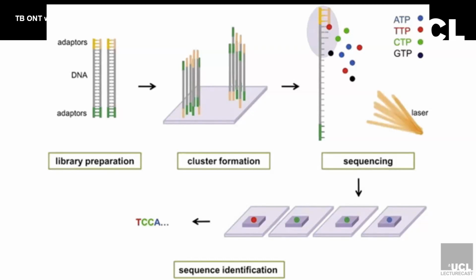So then after you get those sequence readings, you will then use bioinformatics to overlap complementary strands. And then that's what will build up your full sequence.